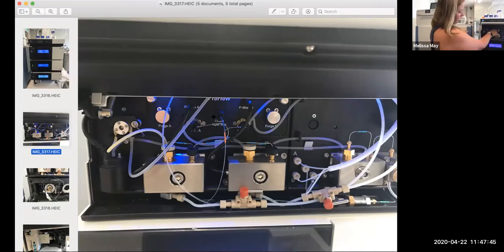What you would do is unscrew this Viper fitting, which I guess I don't need to do. And then we have a tool somewhere in my little messy drawer that you hook up to it. And this basically just allows the connection to drip fluid out as it's purging that pump in case you have any air bubbles in there.